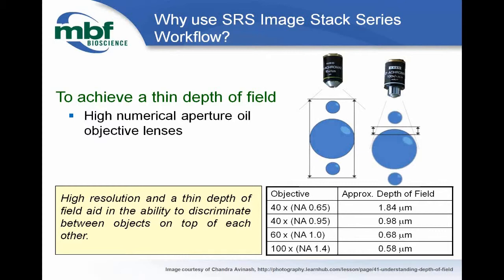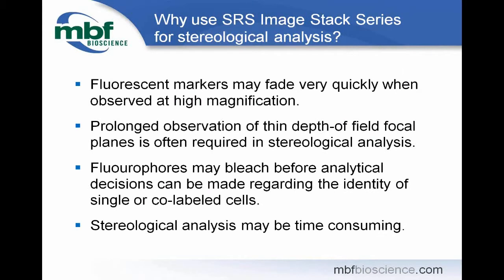So as a microscopist, why use SRS Image Stack series? Well, there are a number of reasons. Fluorescent markers may fade very quickly when observed at high magnification. Prolonged observation of thin depth of field focal planes is often required in stereological analyses.